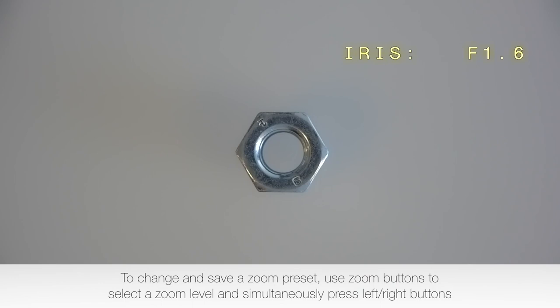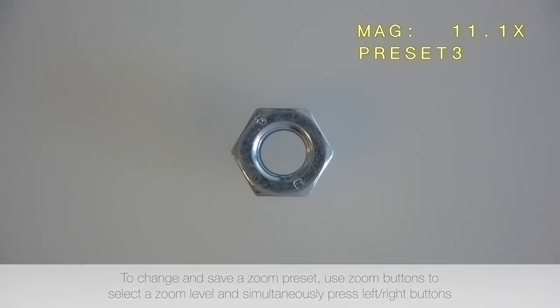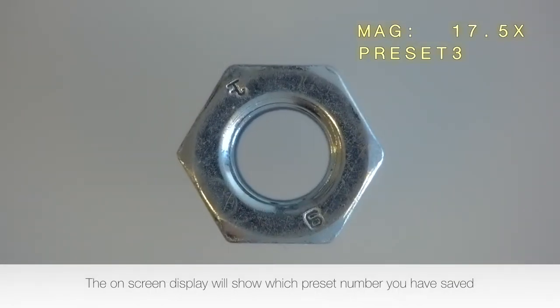To change and save a zoom preset, use the zoom buttons to select the zoom level and simultaneously press the left or right buttons. The on-screen display will show which preset number you have saved.